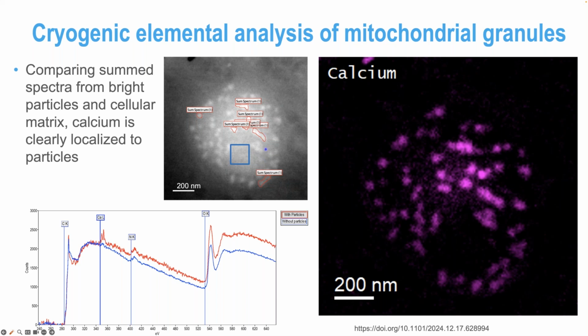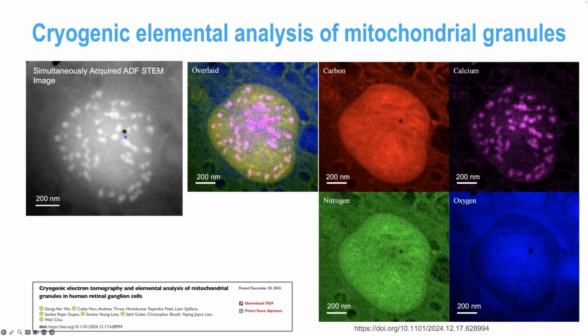Oh, the black dot, this one? Yeah. This was when we were not so familiar with the sensitivity of frozen cell sections, and that's actually a damage position. So we weren't very rigorous with where we were parking the beam, and made a small hole in the sample. So yeah, you need to be very careful, very careful.